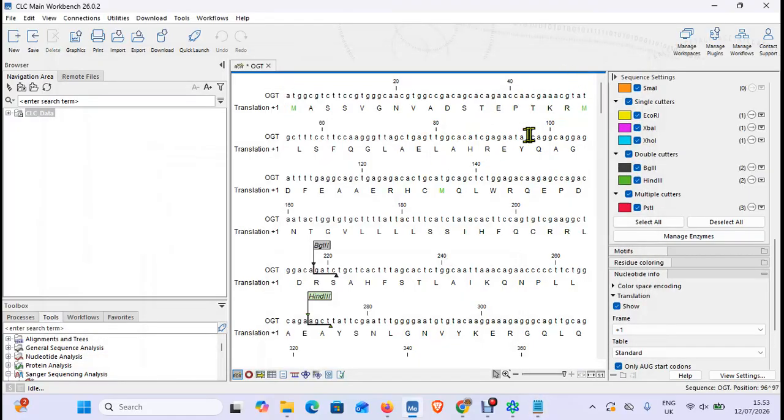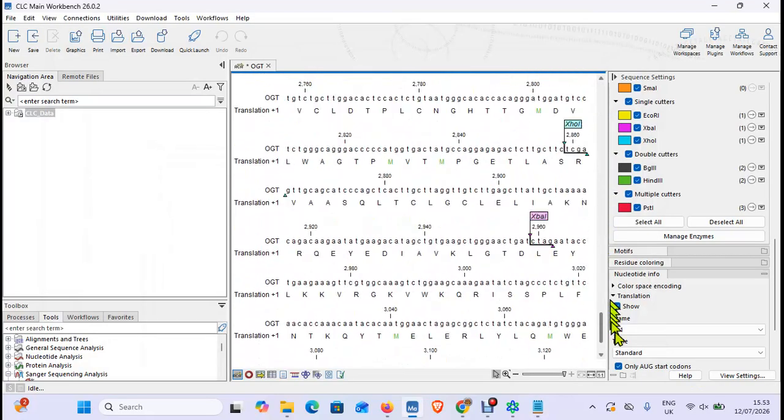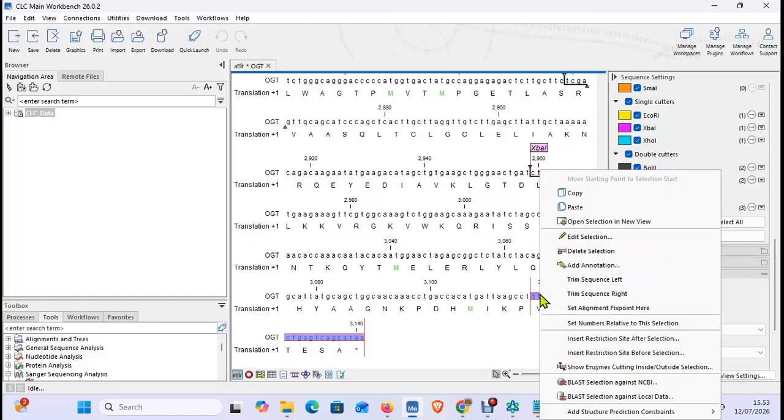And now it's time for the reverse, which does require you to have your head a little bit more firmly attached. So in this case, we track backwards from the stop codon. Same rule applies. So we have 8, we have 12, we have 22, we have 30, we have 40, we have 52, we have 60, and, well, okay, 68. Also very workable.